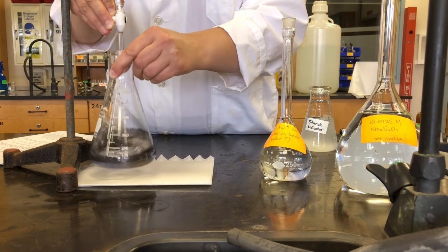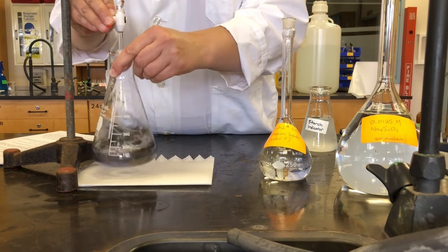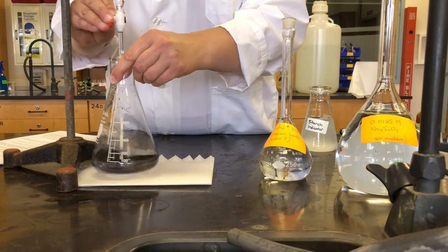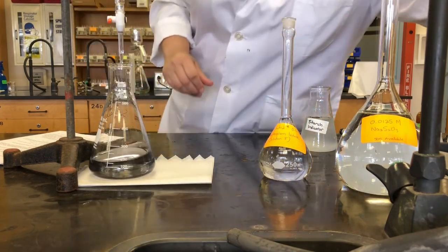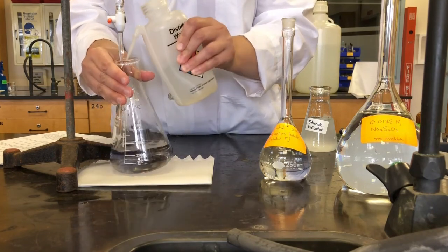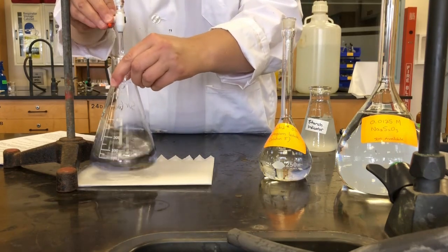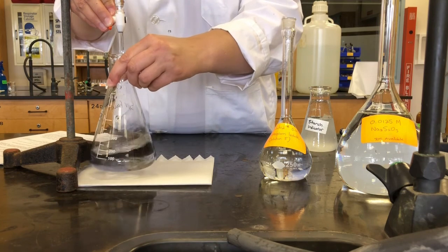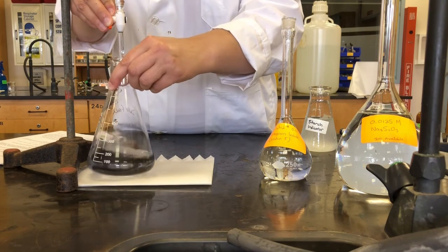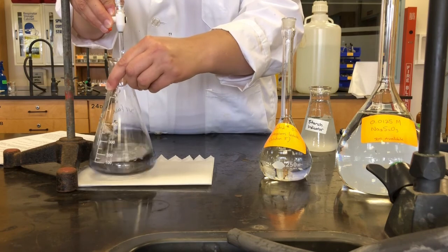Very close to the end point here now. Probably one more drop. I'm going to rinse down around the sides of my flask before I go any further. Just make sure that all of that thiosulfate's down in the solution. There isn't any left up around the sides of the flask. I want all of that blue color to be discharged from the solution.